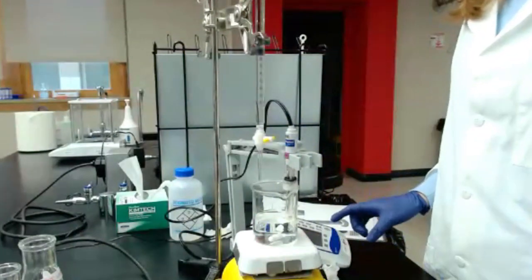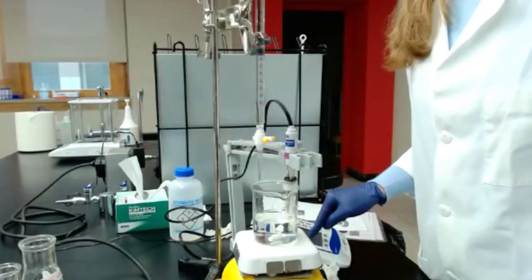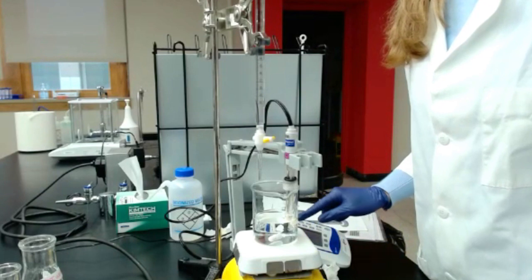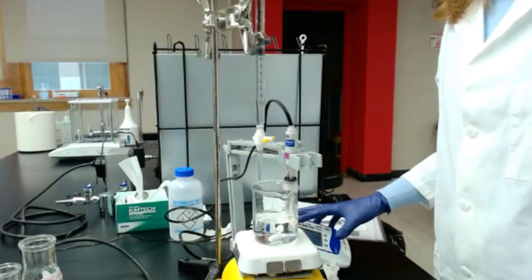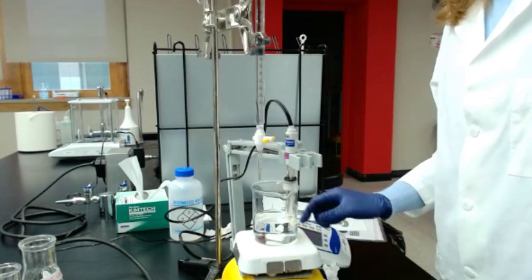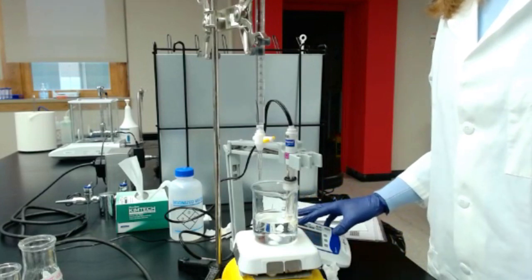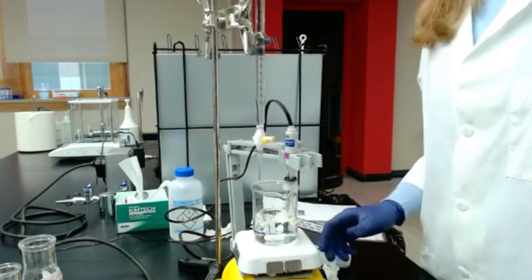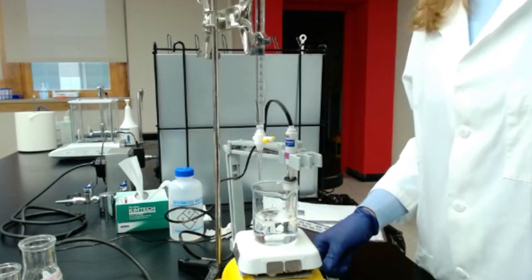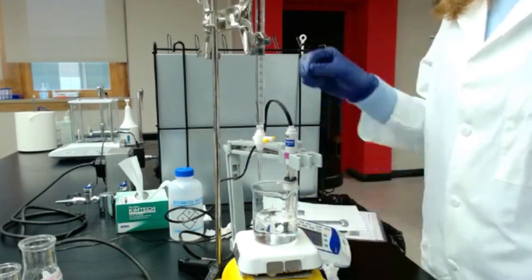Once you have that, look at the pH you have. Click measure on the pH meter and see if you have a pH that is stable first. And that should be 8.2. That's the goal. If you don't have pH 8.2, you will add a little bit of sodium hydroxide.